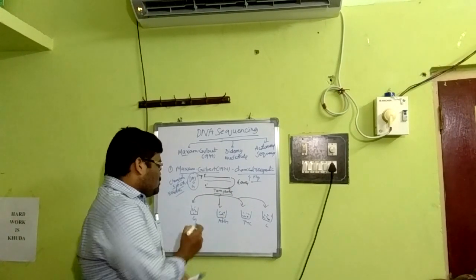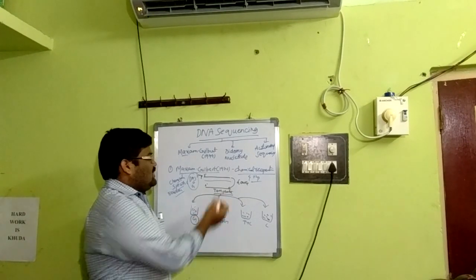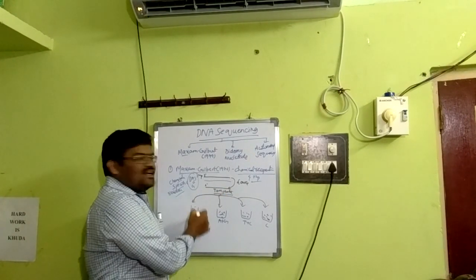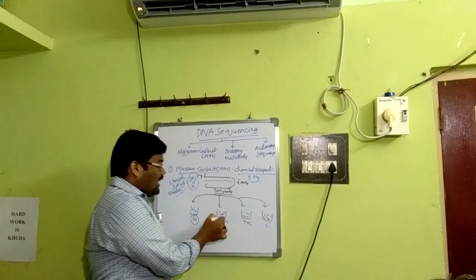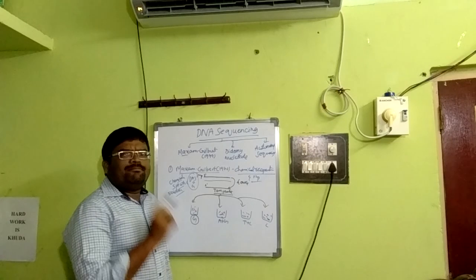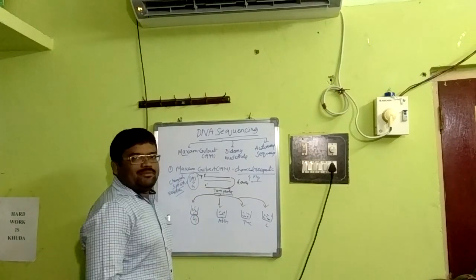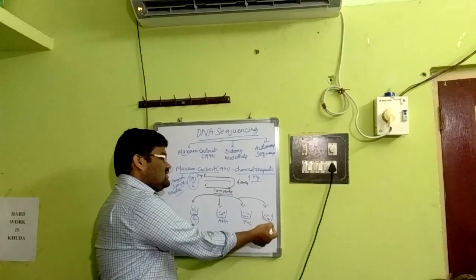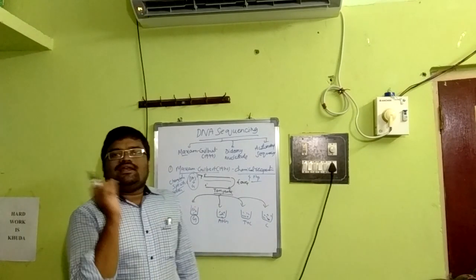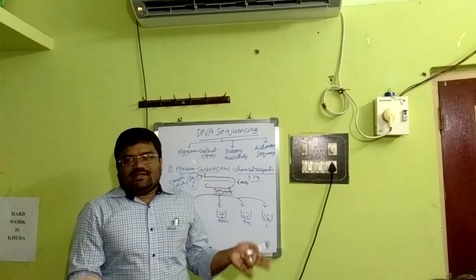For example, G means here it acts on G residues. That means the template strand contains guanosines and this particular chemical acts on G. Then another one targets mainly adenine residues, occasionally guanosine as well, that means G residues too. Then thymine, then C, cytosine. When it specifically acts on this residue, it will break down the DNA into smaller fragments.